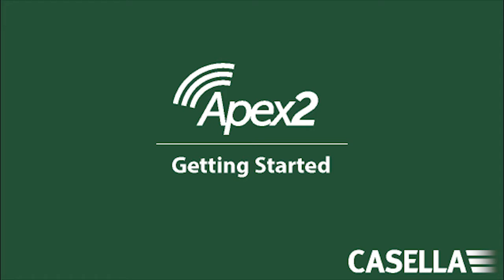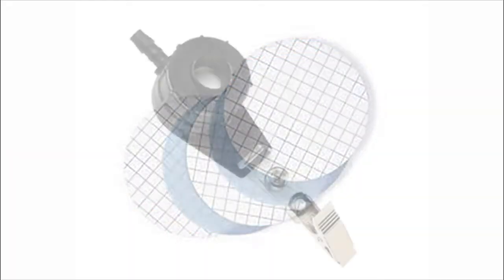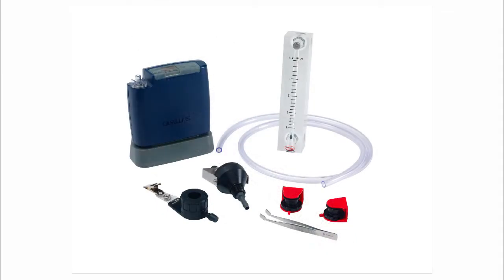This video shows how to set up the sample train for personal air sampling. The sample train is the combination of the pump, accessories, filter and sampling head. In this case we are using the Apex 2 personal air sampling pump.